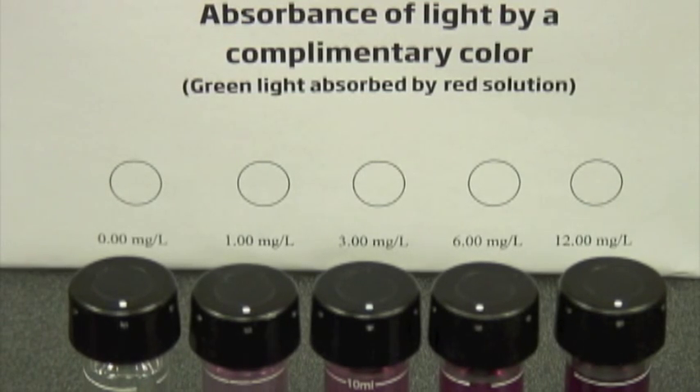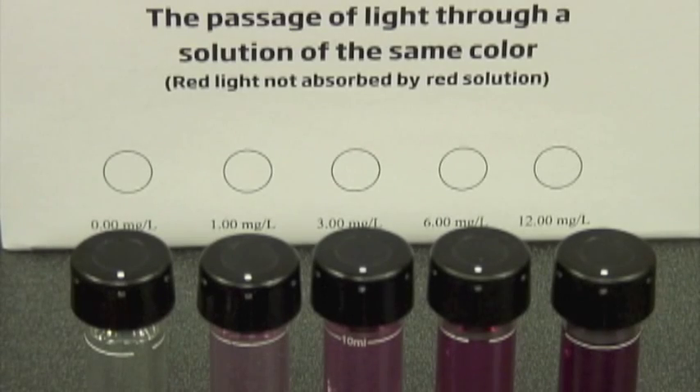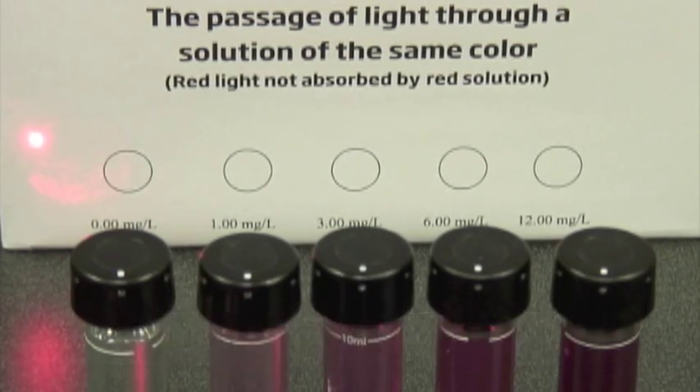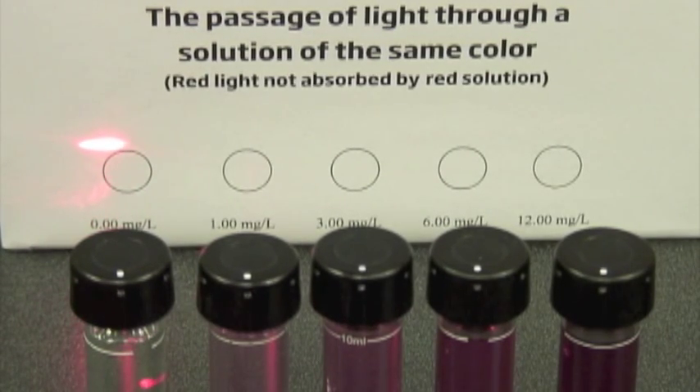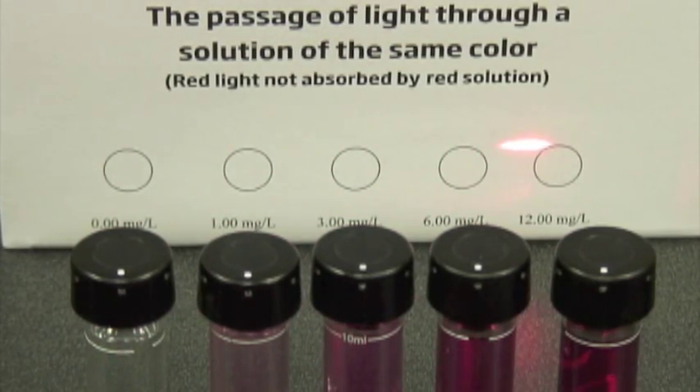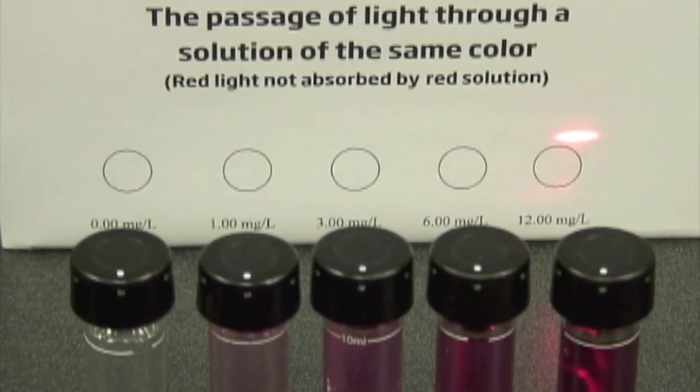If we do this by comparison with our red laser — we've already done the experiment with the green laser, where we demonstrated that the light is actually absorbed by the complementary color solution. In this case, we're actually going to repeat the same experiment using a red light. According to our hypothesis, this should actually not be absorbed. Going through our clear solution, we see a little bit of dimming, and that's a good characteristic to check in the others. As we go through, we just don't see any major dimming — not anywhere near what we saw with the green laser. And this effectively proves that complementary colors are absorbed rather than the same color.